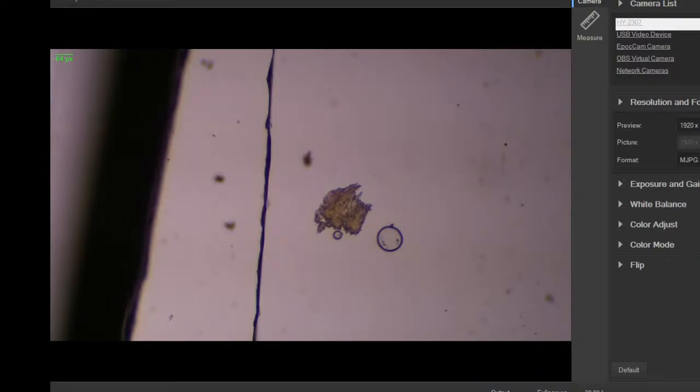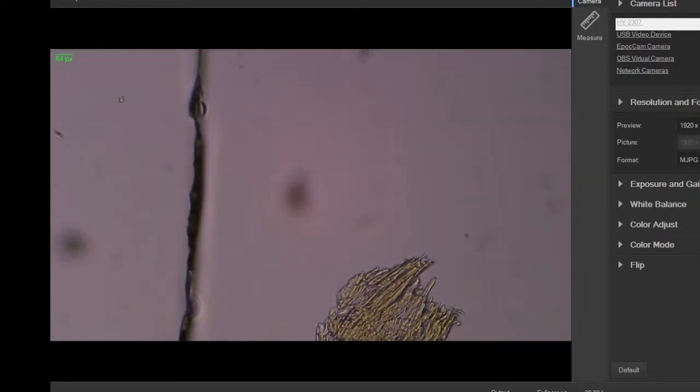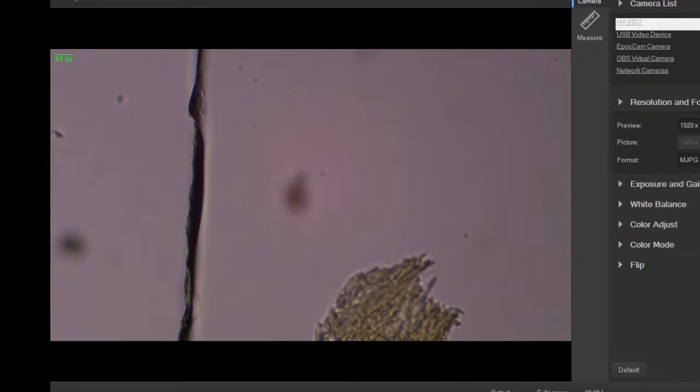Clump of cells. Let's track that one. I mean, that was a little more interesting than the last one. At least it's a stack of cells. You can see that. Or one of the decaying leaves. And just for kicks, go a little higher just to see.